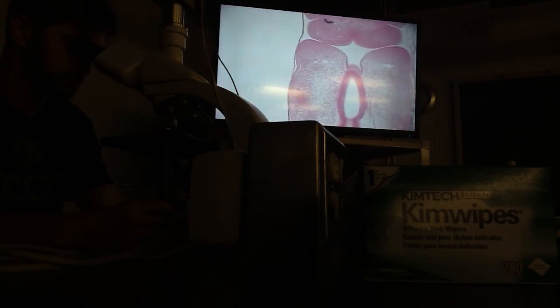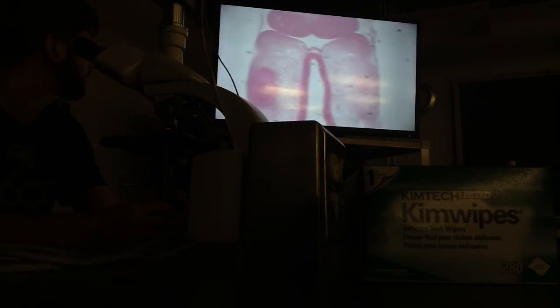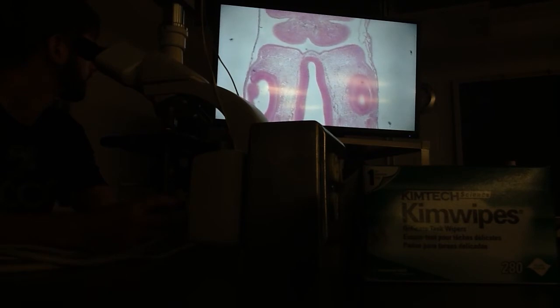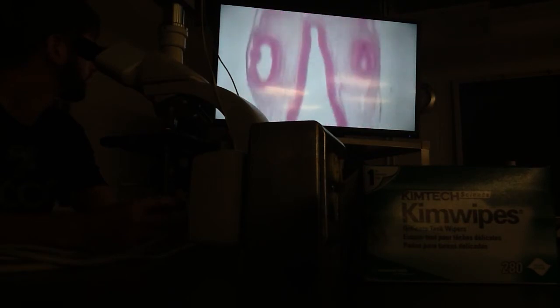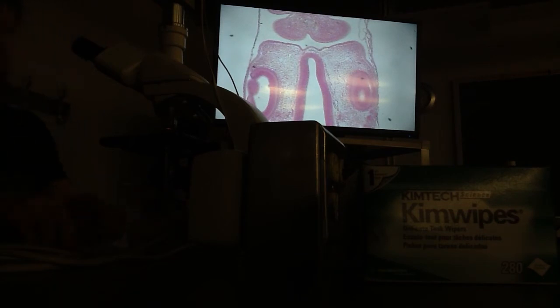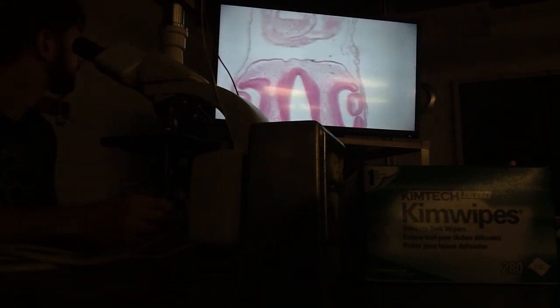So we're in the floor of the forebrain diencephalon, and next to the diencephalon we will see the developing eye. Now, if you can't call that an eye, wow. There's the eye, optic cup, cornea, lens, it's all there, and eventually it will show connection to the brain. Show, please. Eyes come from what part of the brain? Eyes are adjacent to diencephalon.